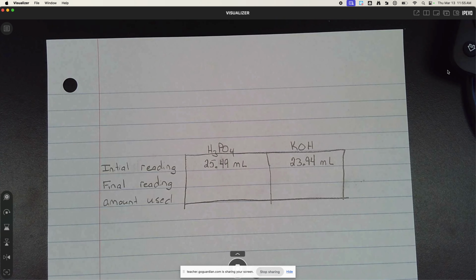My paper there, open up the potassium hydroxide, and for a while I can let this run pretty quick. I'm going to start to see hints of pink appearing when I get close. And that's when I'm going to know I need to slow down this operation a little bit.